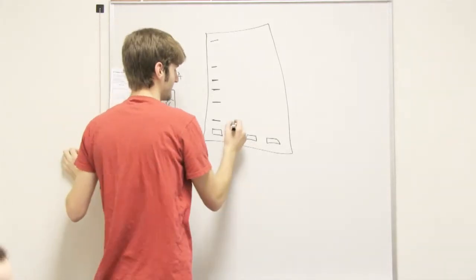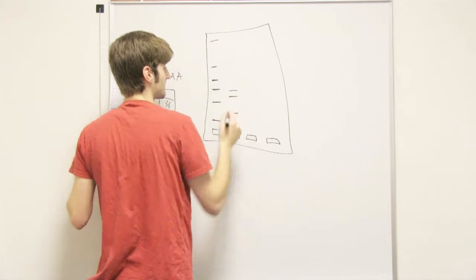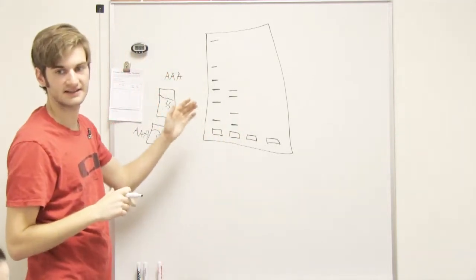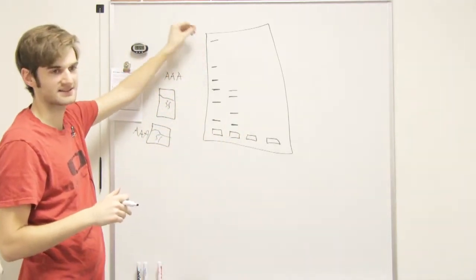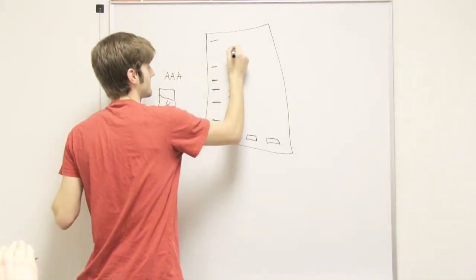So then you have 3 suspects, and... So is the marking how far it made it into the gel? Yeah, that's actual DNA. The actual DNA is the line, and that's as far as it got in the gel. So that's how it shows up in the gel? Yes, exactly.